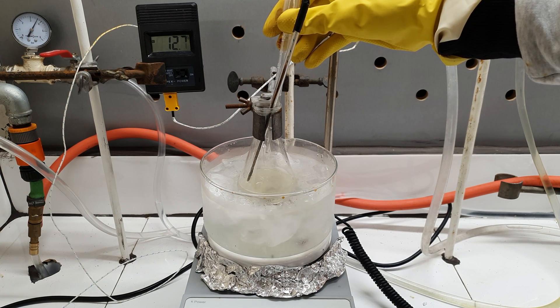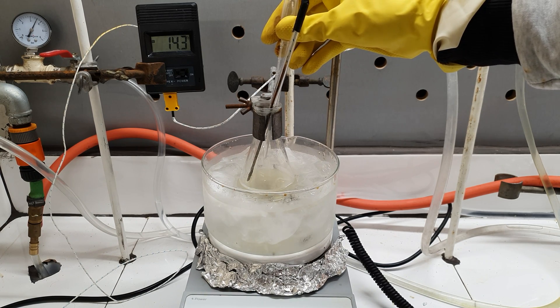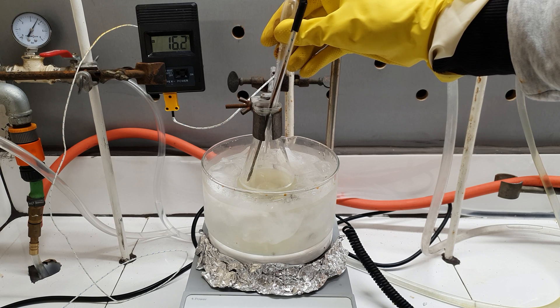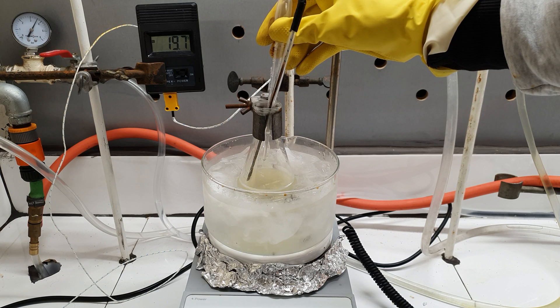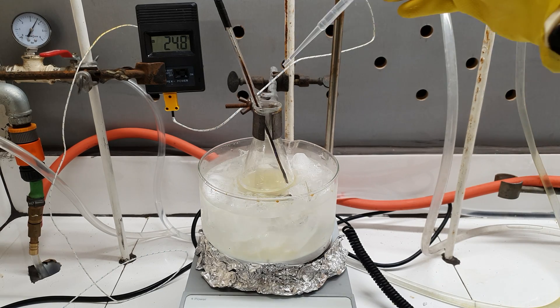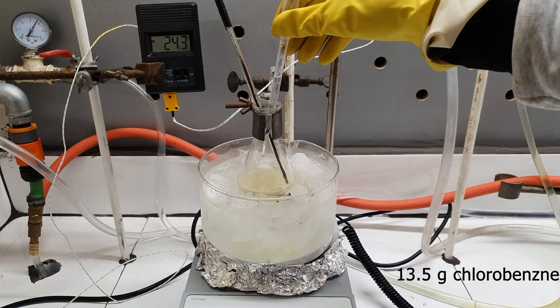The addition resulted in a sudden spike in temperature, and using an ice bath for this reaction was absolutely mandatory, because the temperature should never rise above 40°C. If that happens, trinitrated products will form, which I'm pretty sure your imagination is great enough to get an idea about. In total, I added 13.5 grams of chlorobenzene, which took me about 10 minutes.